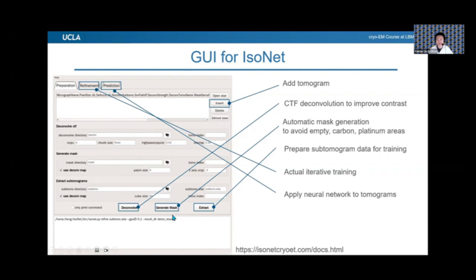And yes, so this one you can provide your own mask. And there's another option called Z-axis crop, which can crop along the Z-axis. So there are a lot of options you can try for the masking. We actually think a lot about the masking.